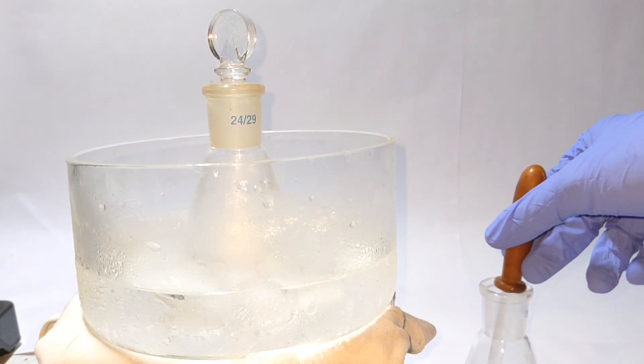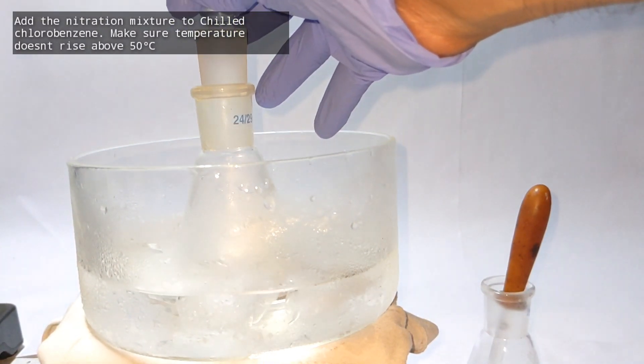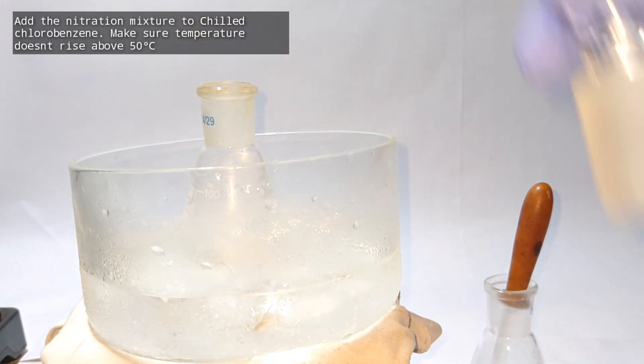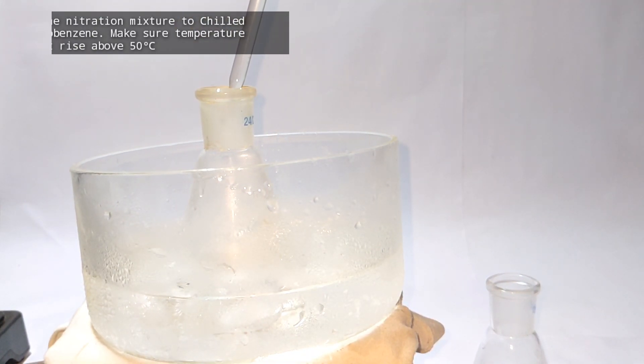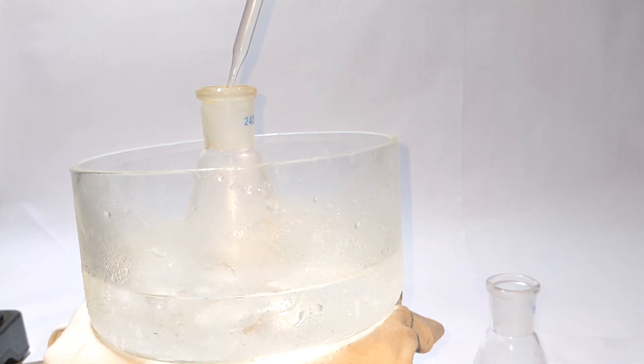Here we have the chlorobenzene and now we add the nitrating mixture using a dropper. Care should be taken not to let the temperature go above 50 degrees Celsius. So slowly add the acid mixture dropwise with continuous stirring.